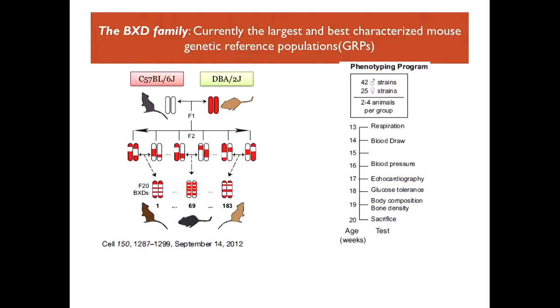So now why am I talking about this? Because we now have a resource of basically like a gigantic family, with each family member having multiple copies that can be used for experimentation, and the variability is somewhat understood and of course can be measured. So we have loci, of course, on each locus there's either the allele from this one or from this one, but not a different allele. And these mice have been through a consortium project, been phenotyped with large numbers of phenotypes. And now this allows us to ask, how do the measurable phenotypes that can be measured on these mice relate to the genomic alleles in specific loci?